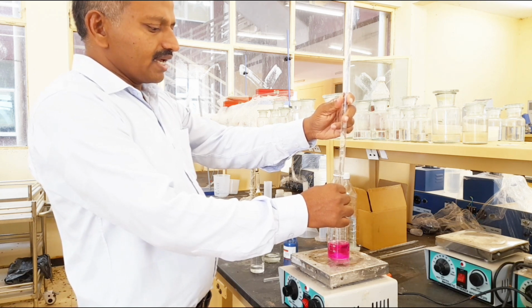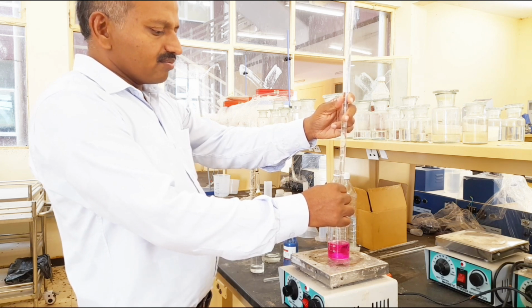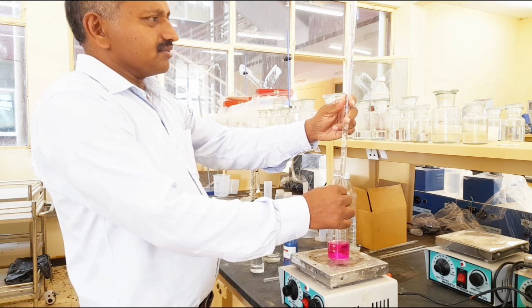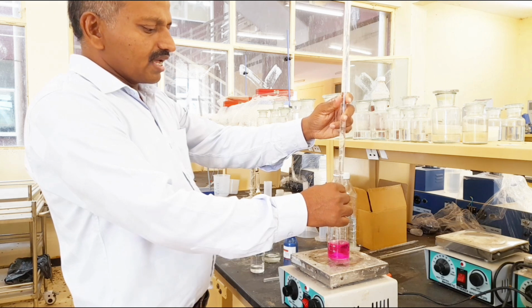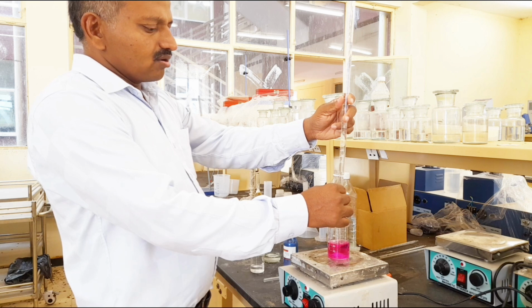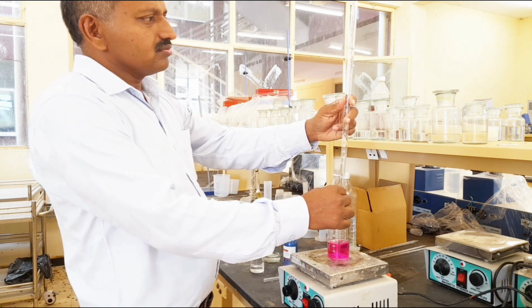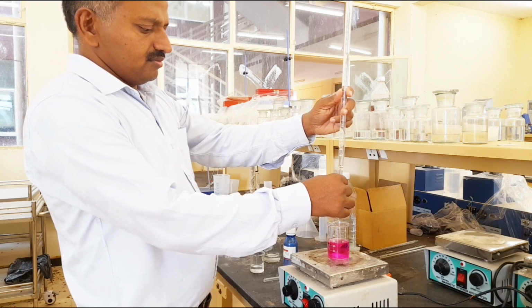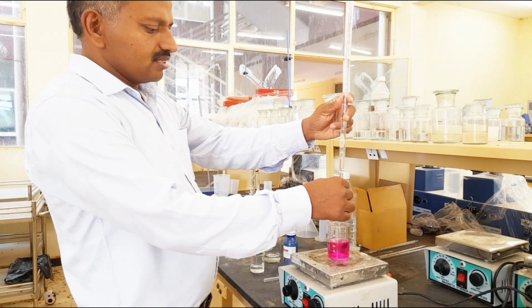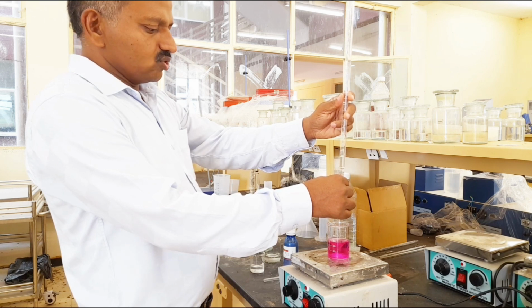After that, if you add an excess of one drop of HCl from the burette, immediately the color of the phenolphthalein changes to a colorless solution. That will be the end of the reaction. Now let us see when the color changes. Slowly we have to add the hydrochloric acid so that the reaction will be fruitful. You can observe the color. Still sodium hydroxide is there in the beaker. Slowly it will convert into sodium chloride.